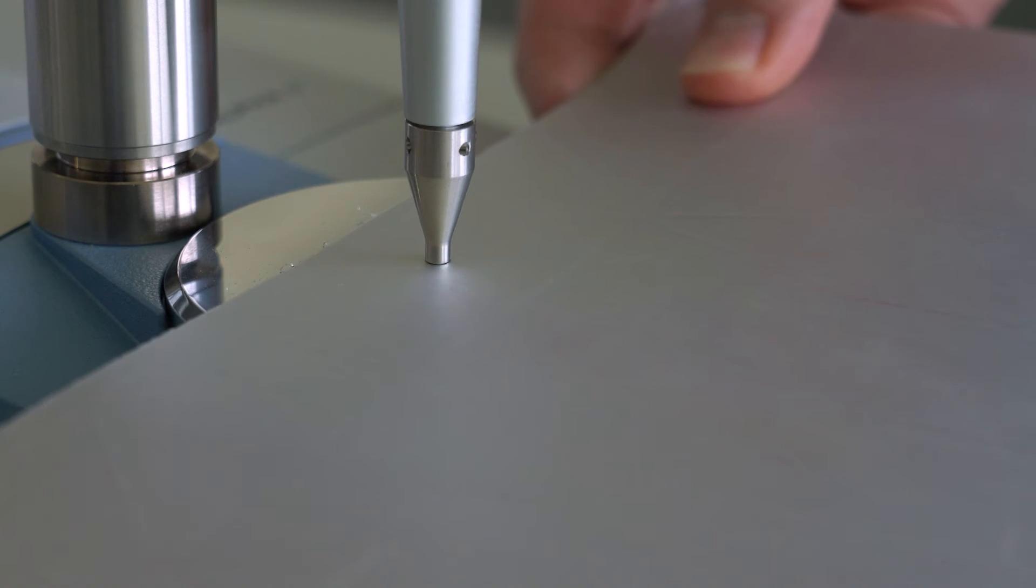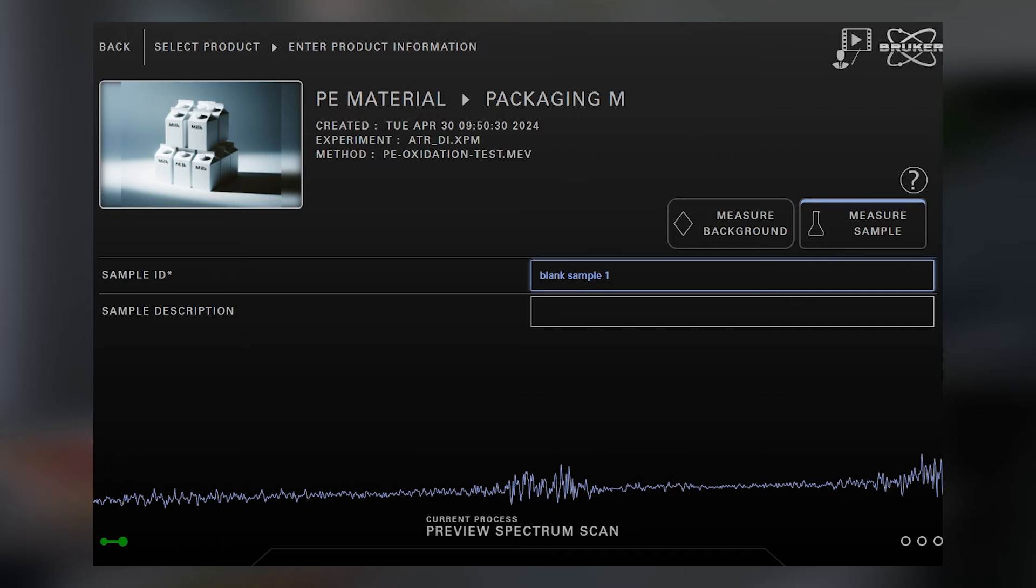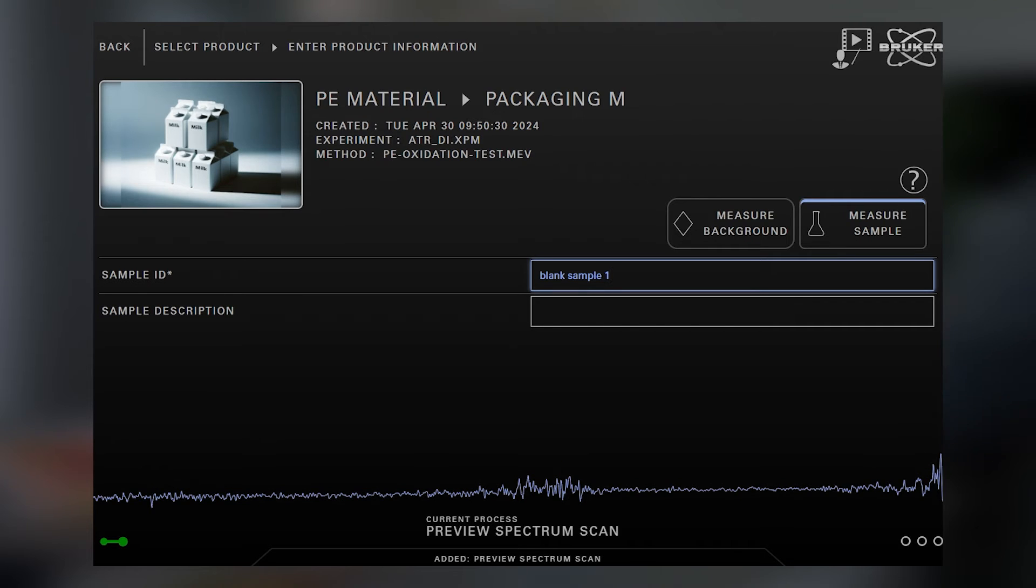After applying pressure, we are ready to continue by clicking Start Measurement.